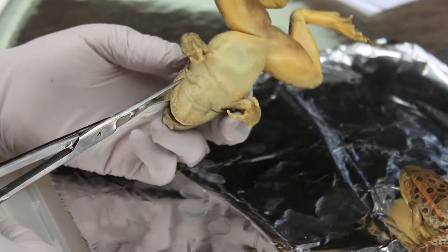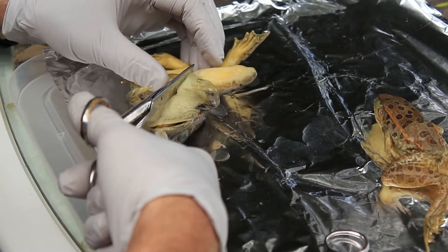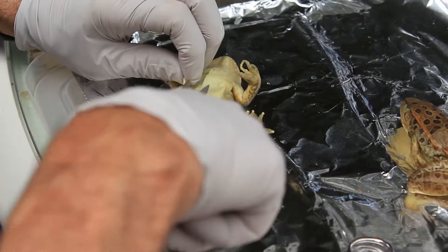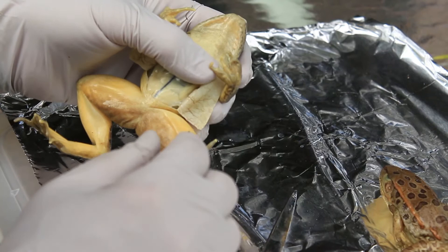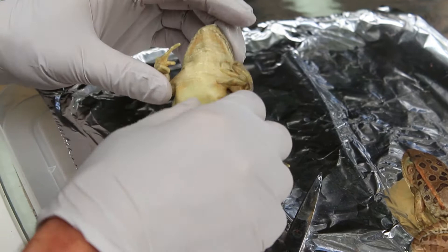So we cracked the jaw — that's the first thing we're going to do. Now the skin is unique. We can also look at the skin here. We're going to lift a little bit and see the musculature here. A frog has multiple muscles there — if you look under the skin, they have blood vessels, and these blood vessels allow it to breathe with the air. That's how a frog usually breathes — mostly through its skin.